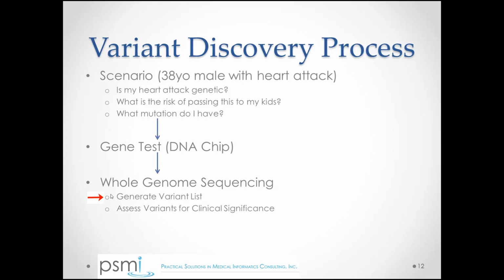One is the technical bioinformatics process of looking at this particular patient's DNA and just cataloging the variants that we see.